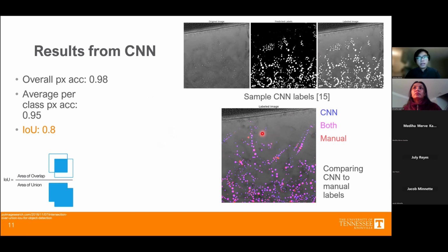When it comes to precision and recall, they should have pretty similar values, just because there's actually not a whole lot of false positives or false negatives. So there isn't a high imbalance between false positives and false negatives.